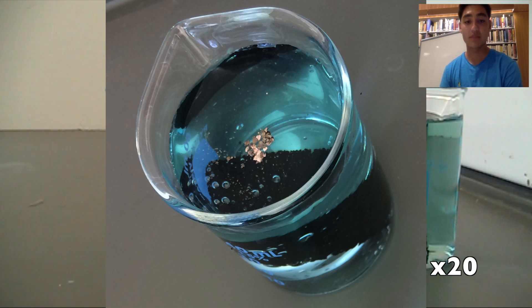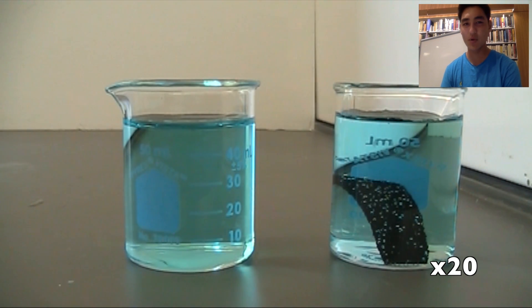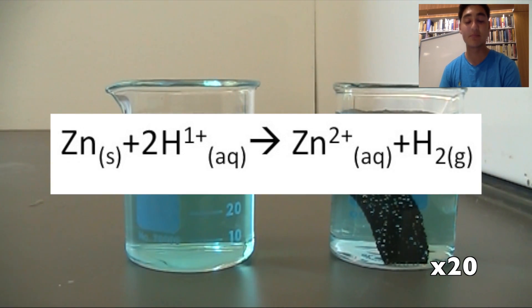The particles floating around the water in the beaker are the solid copper particles that precipitate from the reaction. But where do the bubbles come from? Our chemical reaction does not contain any gases. The bubbles occur because hydrogen gas emerges from the water.